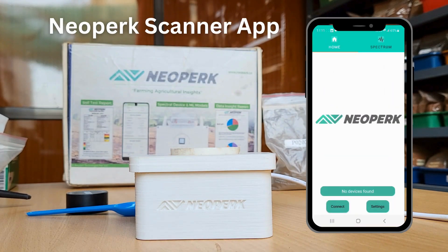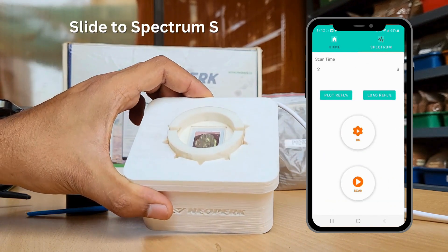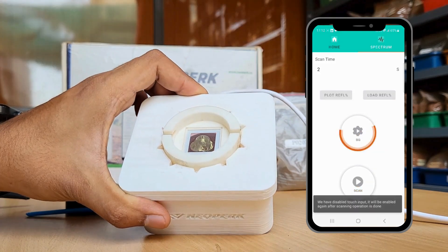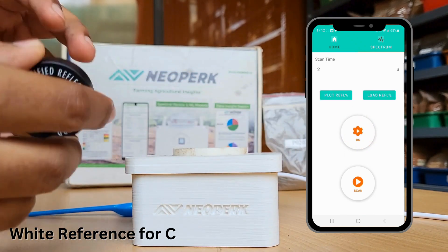Now let's use the Neoperk Scanner app to connect with the device using Bluetooth. Once connected, slide to the spectrum screen and press the first option, BG or Background, to calibrate. Here is a demo scan where you can observe the light coming out of the sensor. Now let's place the white reference material for calibration.